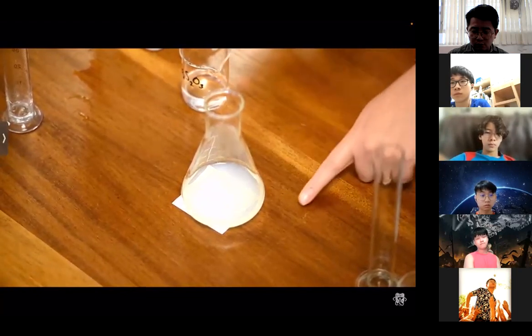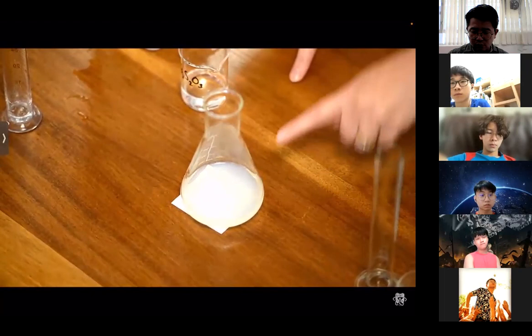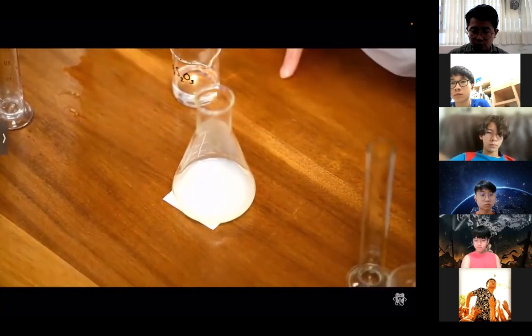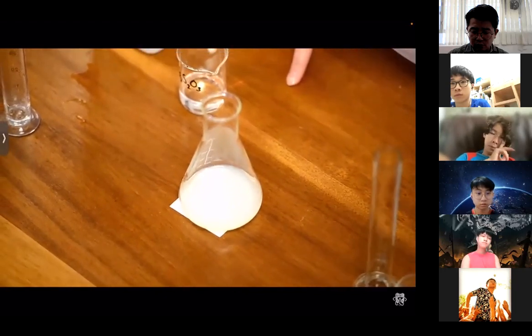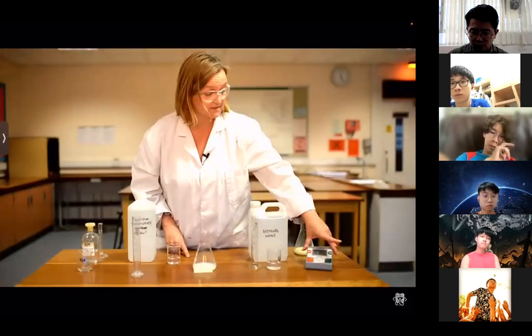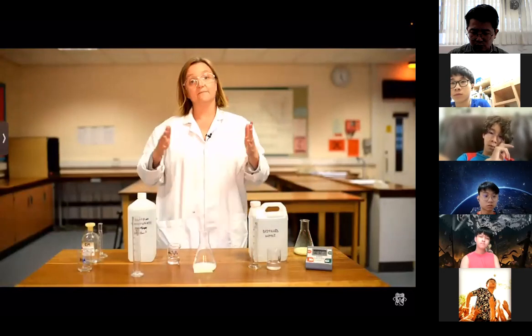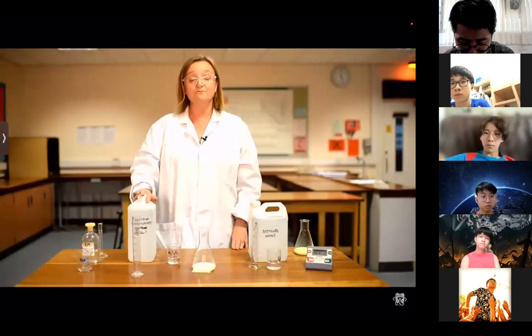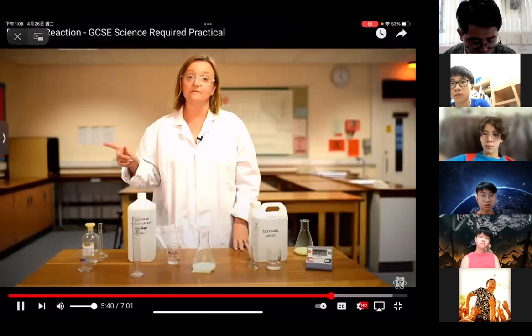So the precipitate is appearing at a slower rate. The time is longer this time. And as I watch from above, the cross has disappeared, this time at 32 seconds. So the reaction time is longer, so the rate is smaller. So I would repeat this for 5 values.